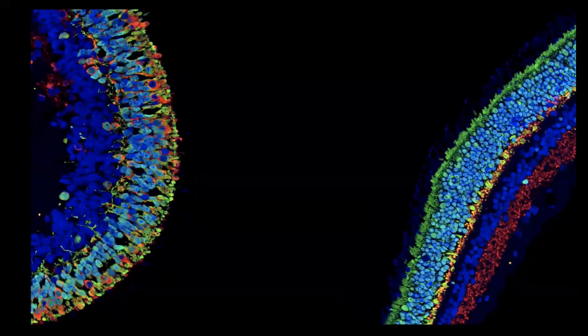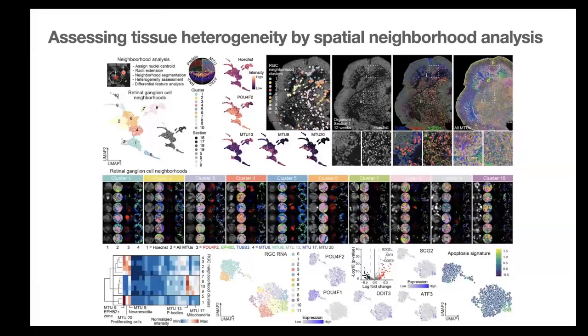Yet another analysis we did with these systems is not using laminar windows, but rather focusing more on nuclei spatial neighborhoods. In that case, I thought we could actually use the same algorithm, but not for windows, but for circles.